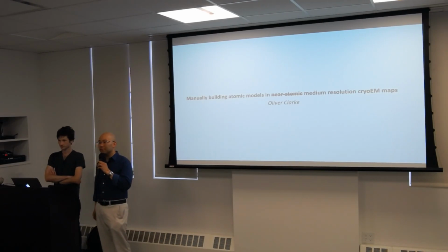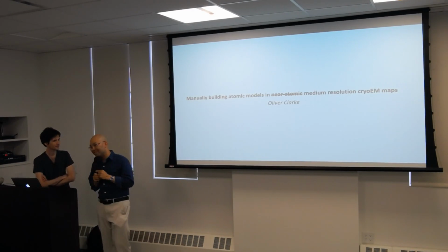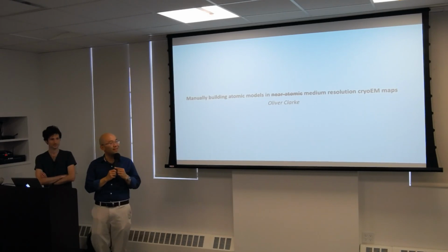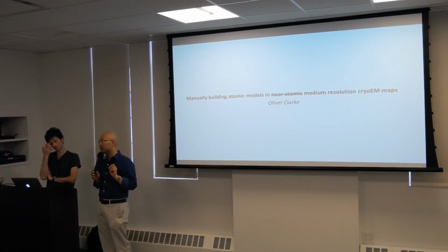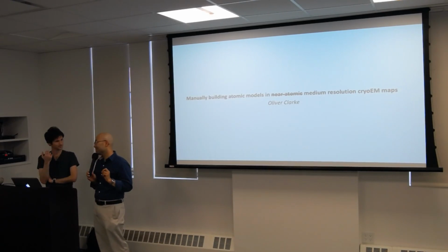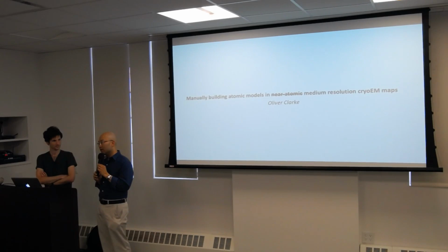Okay. Good afternoon and welcome to the Simons Electron Microscopy Center's Winter EM course. This is our last formal lecture. In terms of where we're going in the field, we're getting higher and higher resolution and self-consistency, and the wish would be to better interpret our maps. Just depositing a density is insufficient. You would want some type of model. And what is that model?